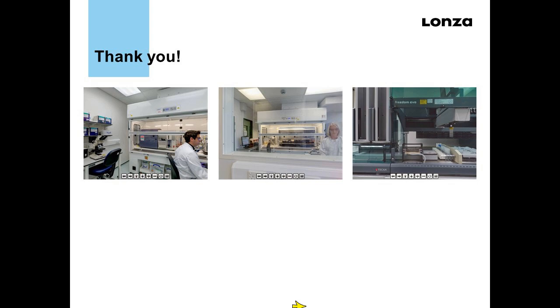And how do the results compare to traditional QC batch release methods? So we have used this method to support a manufacturing investigation. In order to provide justification of why we were using this method, we analyzed some samples that had been analyzed using the batch release method, and we used those same samples here for the screening method and compared them.